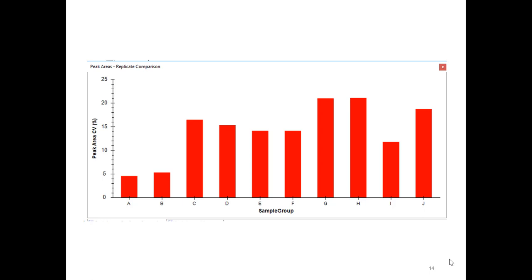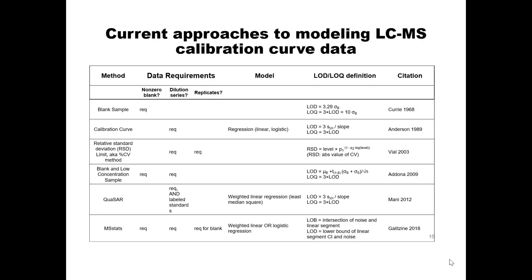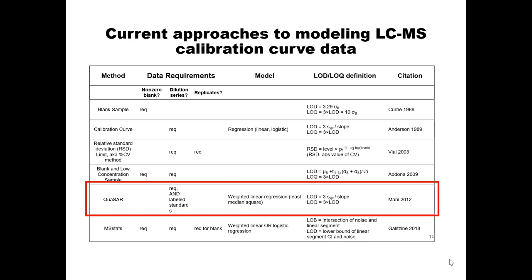By this method, for this peptide, under these conditions, that is not true. So I could have picked a better, more typical or textbook example of a peptide where the CV just keeps increasing the farther you go. But I kind of like that this one generated some conversation, because that sets me up for talking about some of the other models that are a little more statistically rigorous in assessing this, because clearly this percent CV style method does break down. It assumes that your data follows the assumption that CV will always keep increasing as you get lower and lower in your dilution. Your signal will vary more and more as you get lower and lower input values.